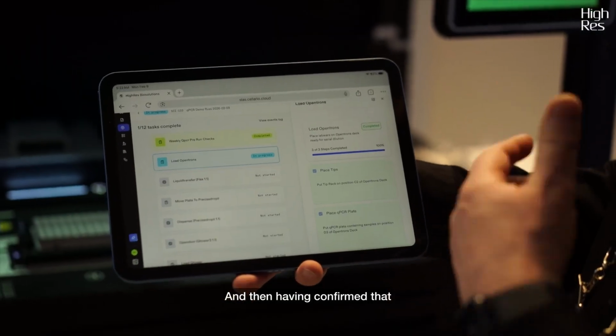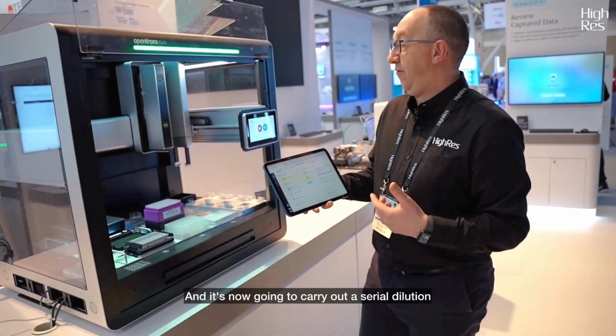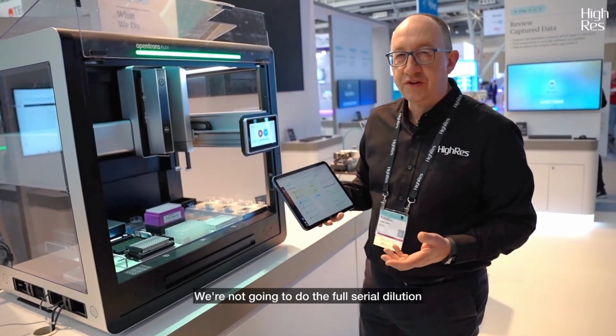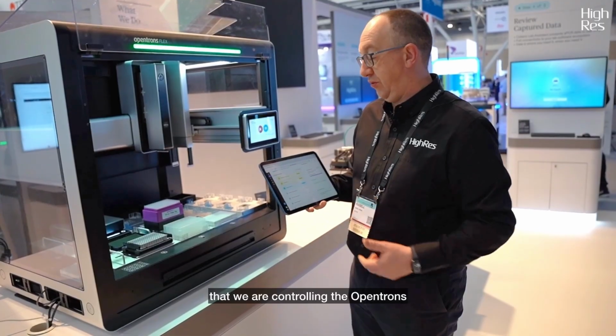And then having confirmed that, the OpenTrons will start operating of its own accord. And it's now going to carry out a serial dilution. We're not going to do the full serial dilution because that would take a little bit too long for the purpose of this demo, but it just demonstrates to you that we are controlling the OpenTrons.